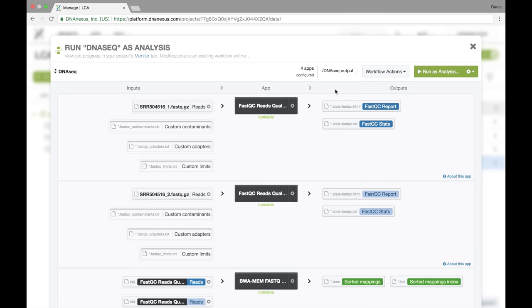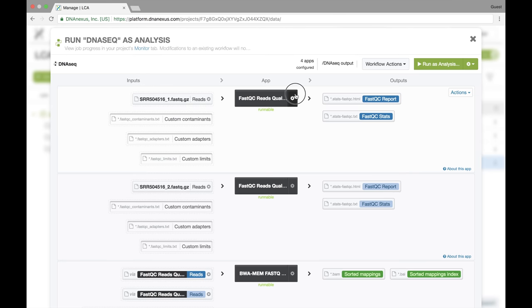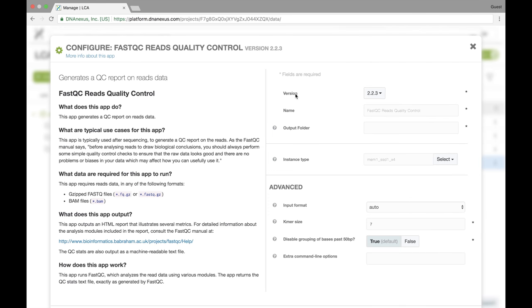Optionally, if we want to organize the outputs, we can set subfolders for each individual step of the workflow. We can achieve that by setting the output folder for each stage.